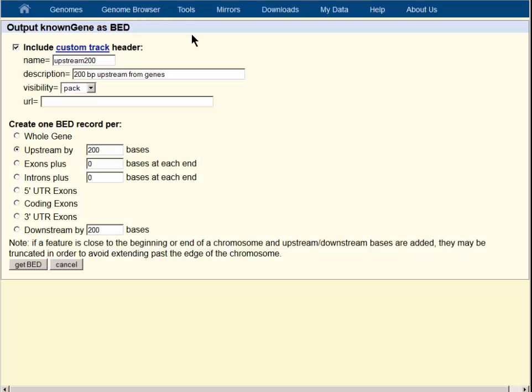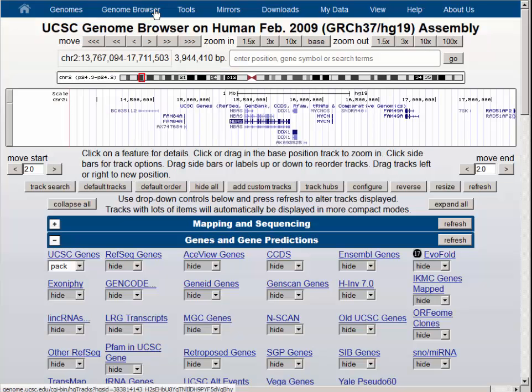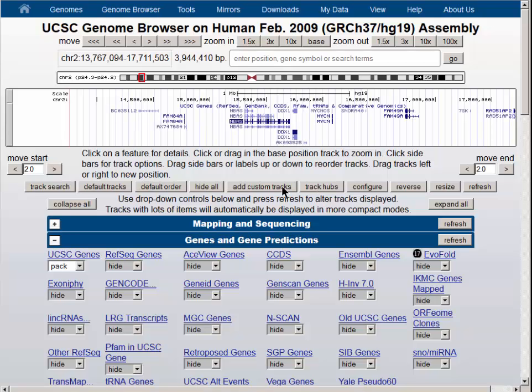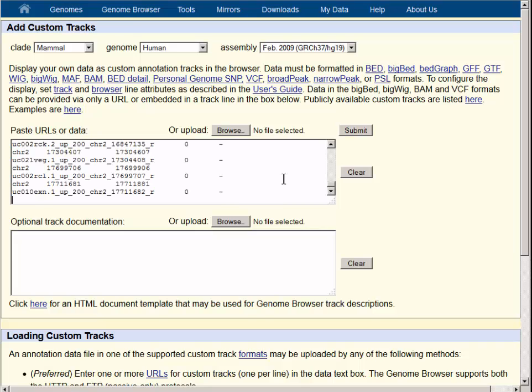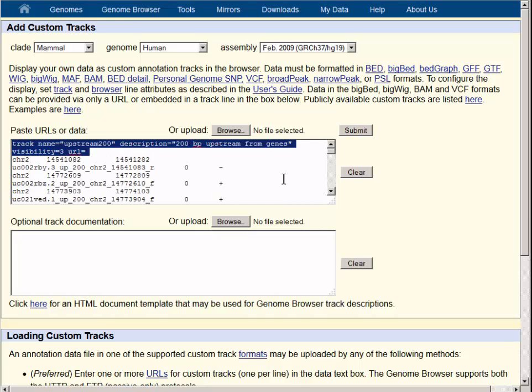The back button takes us back to the table browser, and then the genome browser link takes us back to the browser graphic. Below the browser graphic is an add custom tracks button, which allows us to paste this content into the box. You can see that we have the header created from our choices back at the interface.